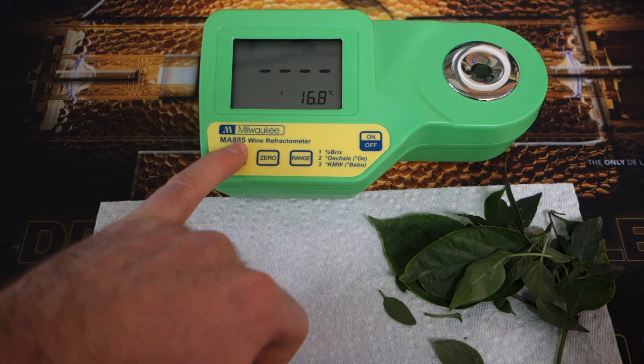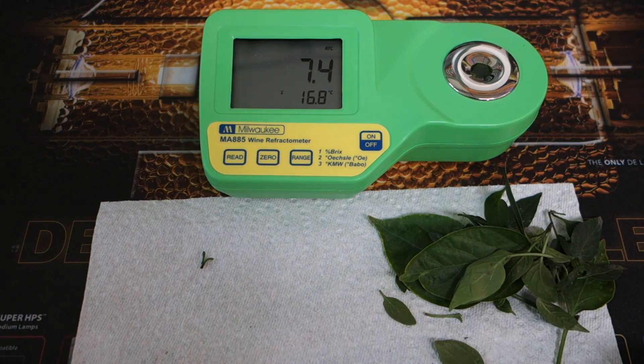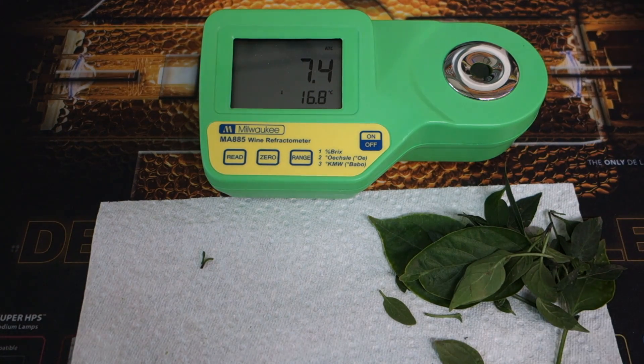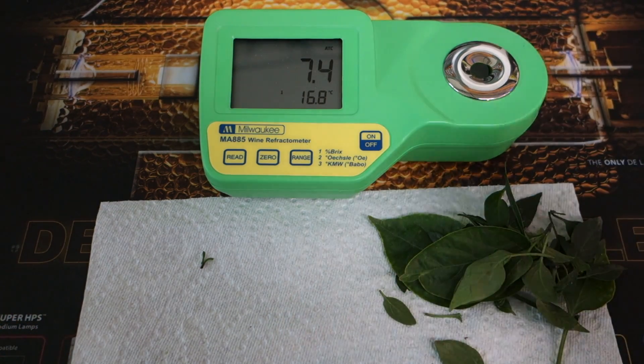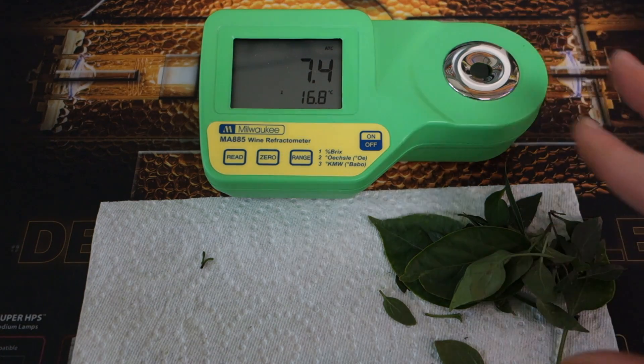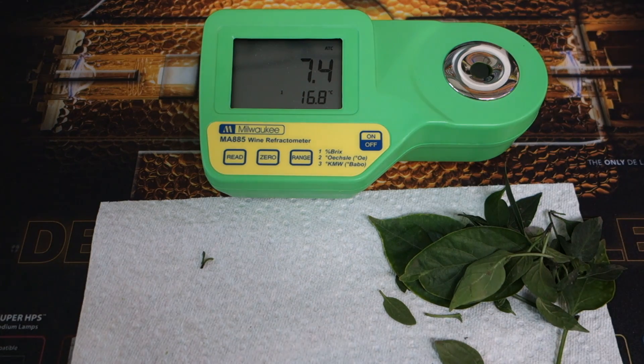We'll take a reading. So 7.4 percent — this is reading a little bit low. We're looking at an ideal of 12 percent or better. I'll clean off the refractometer and try with the organics to see how they're doing.